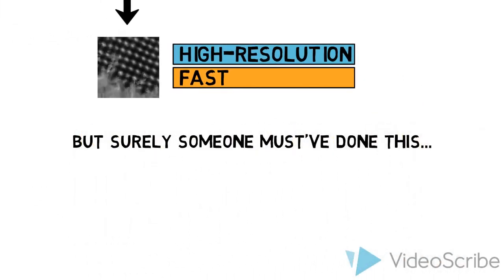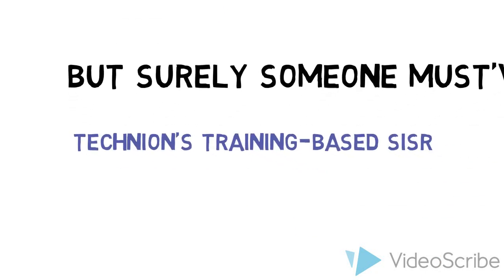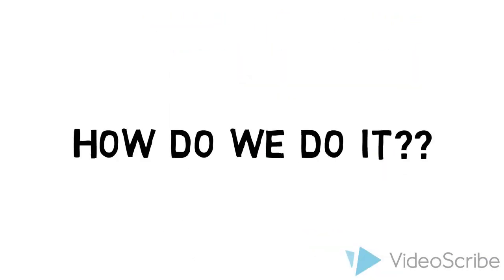But surely, someone must have worked on this before. In fact, there are algorithms, an example of which is Technion's single image super resolution, and we can apply it to electron microscopy, but it produces an image like this one, which is not super informative. So how do we do it?